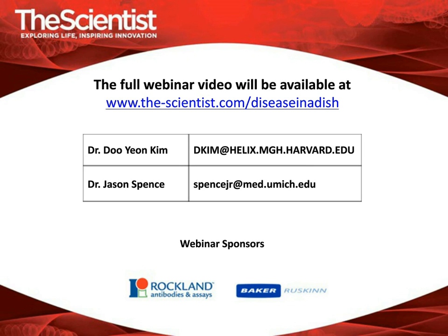And one more thing I would like to add on our side is that because it differentiates into neurons, astrocytes and several other cell types, we've been doing quantitative RT-PCR and several marker stainings, but that's always a concern because the changes could come not only from A beta, but from altered differentiation or fate.